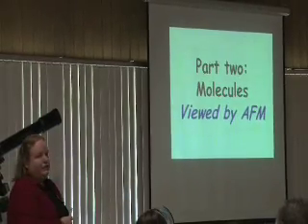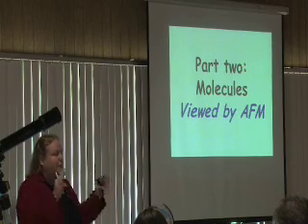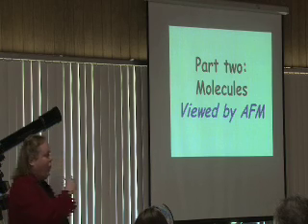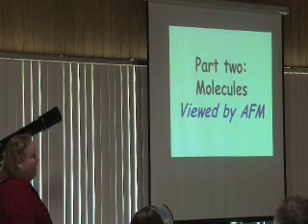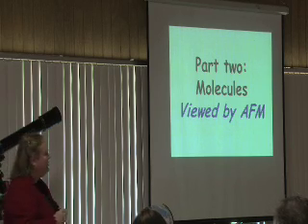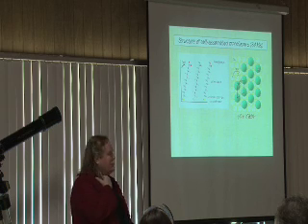So let's move to part two. We saw atoms. Most of the time, you have either one or two atoms, and they're arranged in a periodic crystal regular fashion. They're all the same size. Molecules are a little bit more complicated, sometimes difficult to interpret what you're looking at. I'm only going to show a couple of examples from my laboratory.